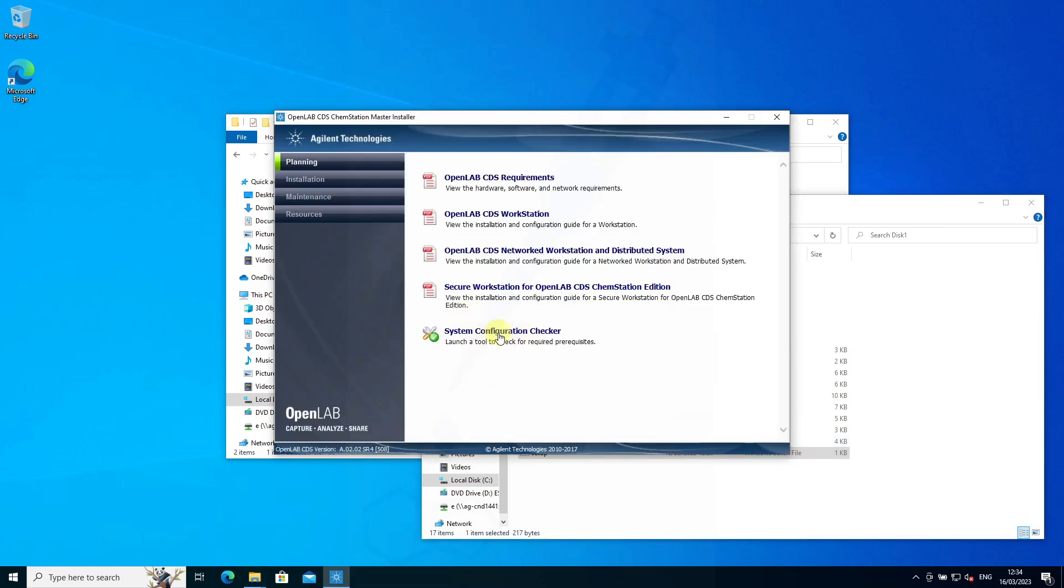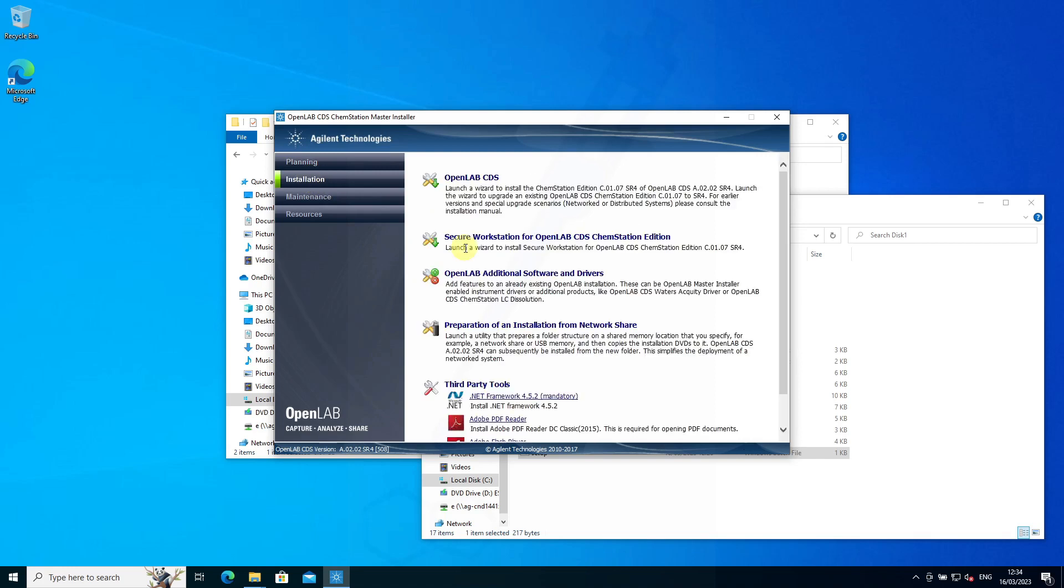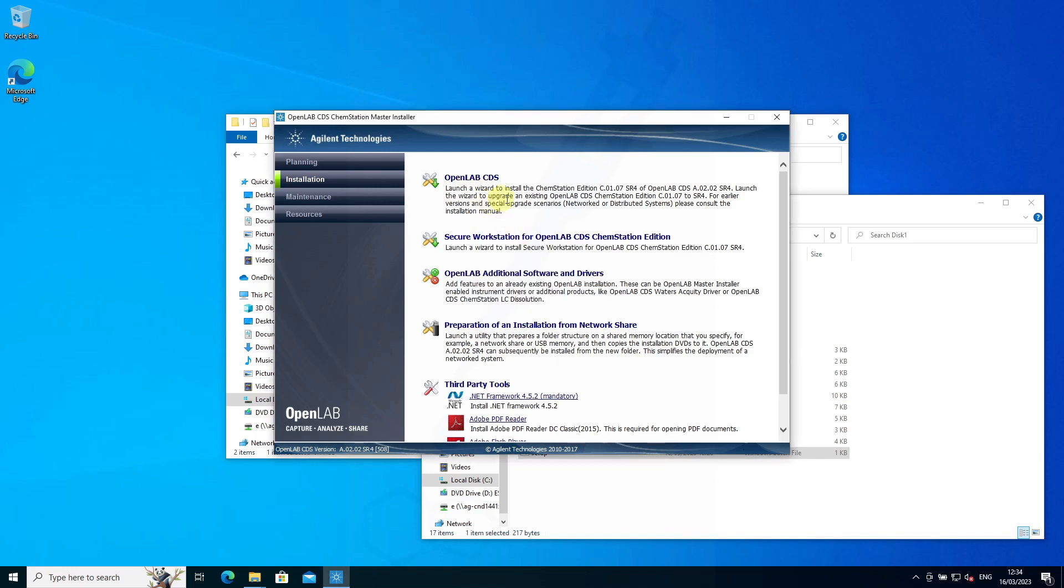We're not going to run through the system configuration checker. It might be useful if you want to launch that tool to check required prerequisites. We're going for OpenLab CDS installation, which will also do a system preparation check and system verification check.